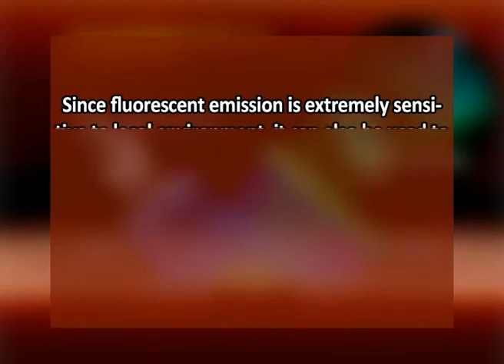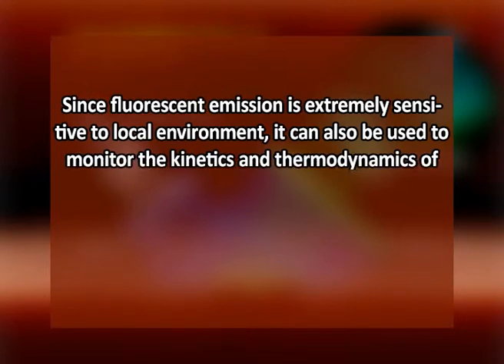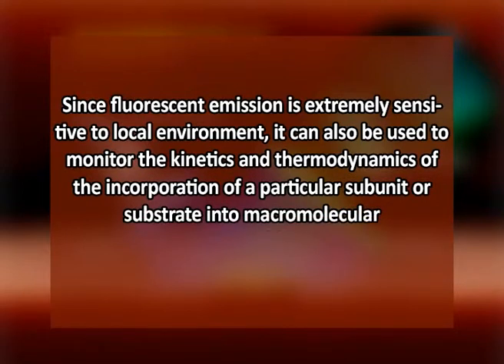Since fluorescent emission is extremely sensitive to the local environment, it can also be used to monitor kinetics and thermodynamics of the incorporation of a particular subunit or substrate into a macromolecular assembly.